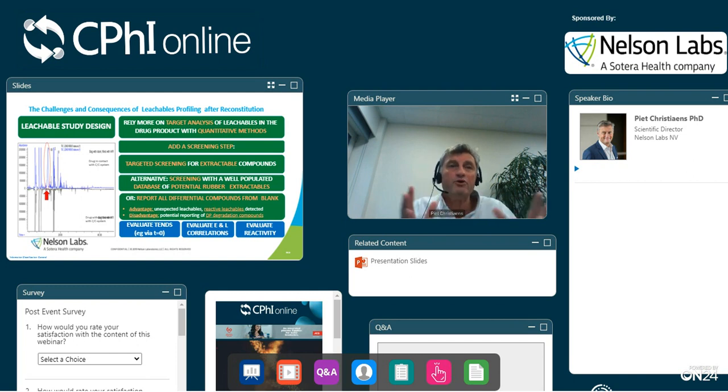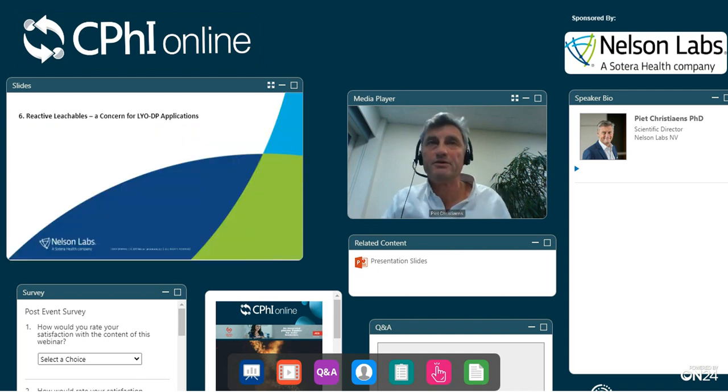So in conclusion, what you need to do in your leachable study is evaluate trends. That means that you need to analyze time points across the shelf life. You need to be able to make a correlation between the results of an extraction study and a leachable study. This is mainly to verify if the design of your extraction study was okay and if you didn't miss anything. And you also need to evaluate the reactivity of certain leachable compounds with the drug products.